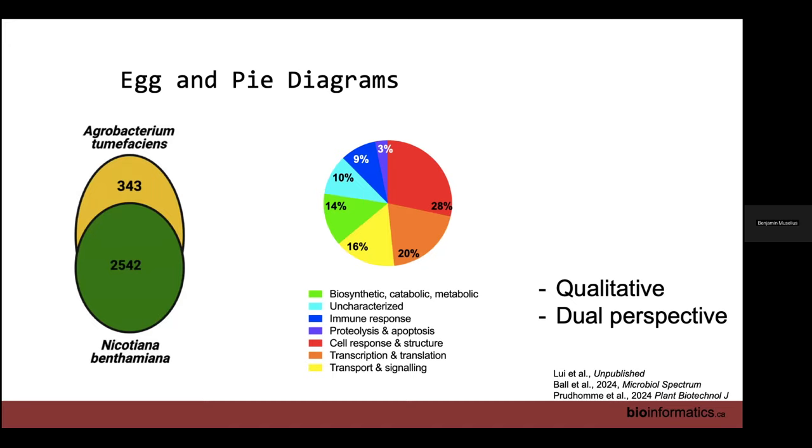And we do this for a lot of our multi-species work. So in some of our publications where we have dual species, we will use such a plot to show the majority, say the host proteome and the proteins that are identified in one system. And then we have another biological system identified as well. And it allows us to demonstrate to the reader in a biological sense that we're identifying proteins from both systems, and there isn't overlap in them. But here are the numbers as to what our coverage is of those systems. So kind of a way to think about it in that sense.